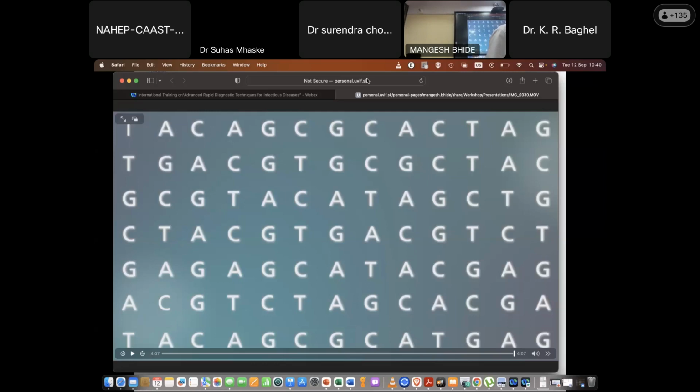When you have non-specific bands, we are going to see the troubleshooting of that all. Principally, you should not send to the company a sample with non-specific bands. You should send to the company only specific ones. Sanger sequencing is not able to sequence two or three DNAs at a time, only one DNA species at a time. So it is wrong to send non-specific.